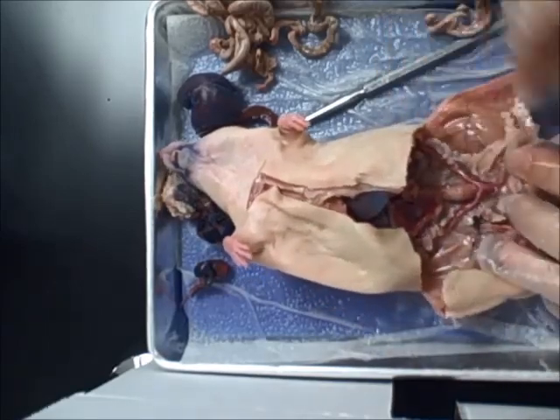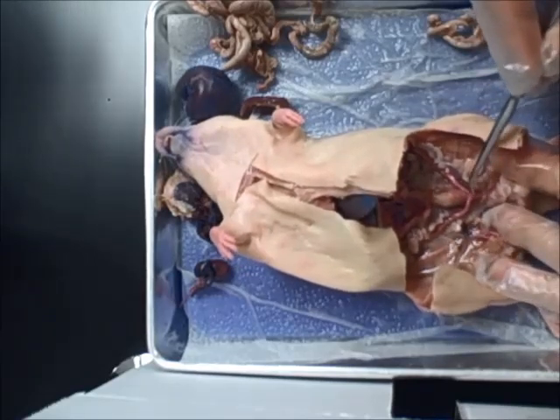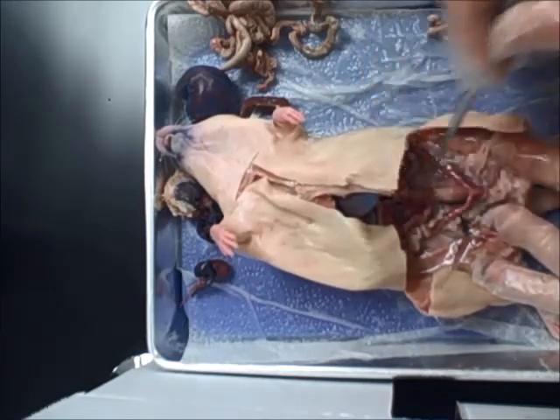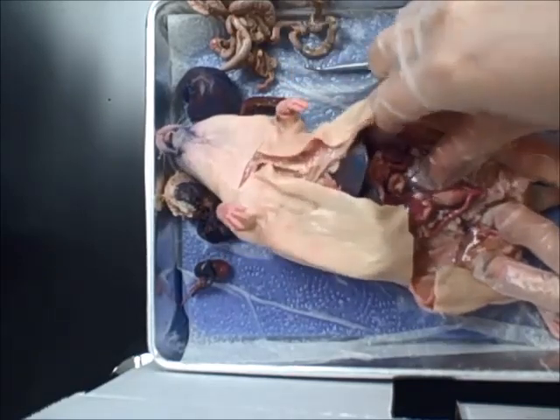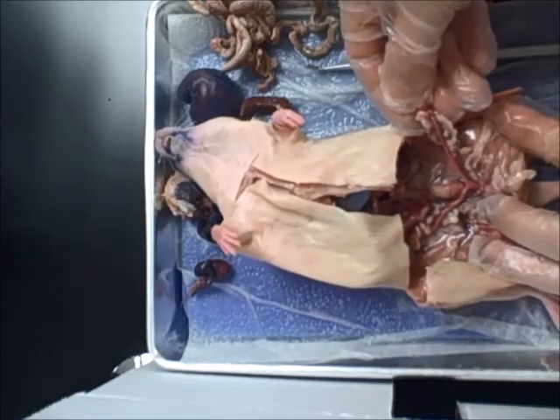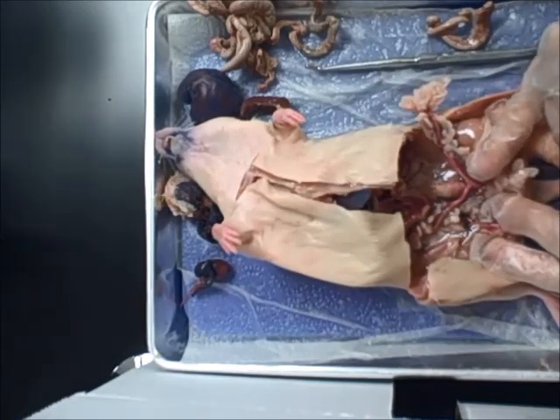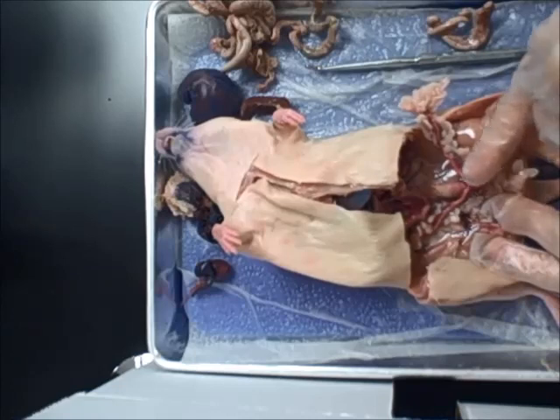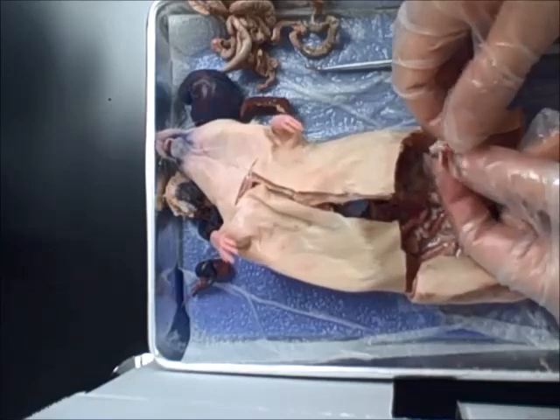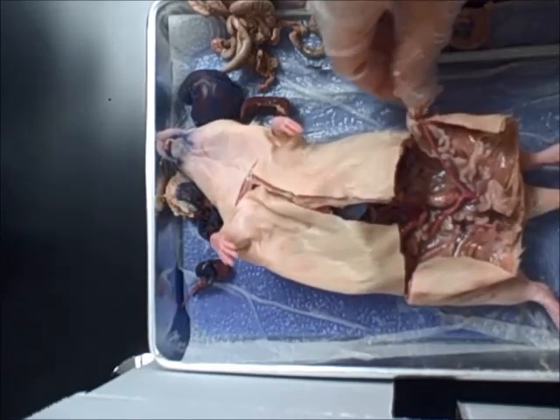So the uterus starts here. It's this kind of bright pink structure that you can see, kind of looks like a longhorn. So here's the beginning of the uterus that would connect to the vagina. Then you have one horn and the second horn, and it's surrounded by fat. The uterus is horned so that it can hold lots of babies. Since rats have litters, this uterus is horned because a lot of times the rat will have between 9 and say 15, 16 baby rats, and so there'll just be little bumps along the whole horn of the uterus, and the uterus ends down here with the ovaries. You can see that tiny kind of circular looking structure in the middle of the fat.